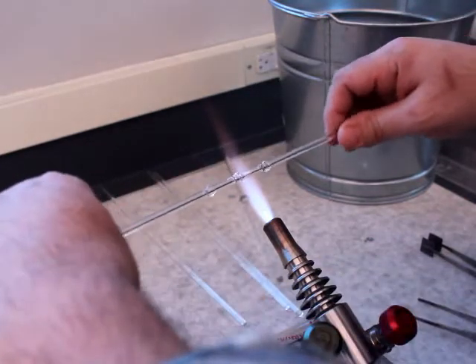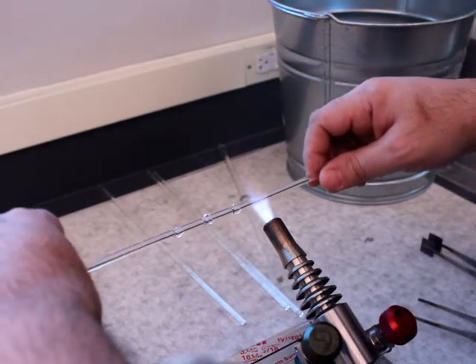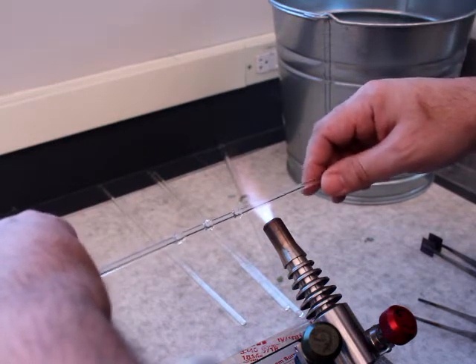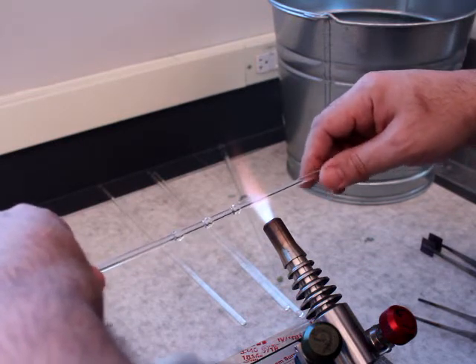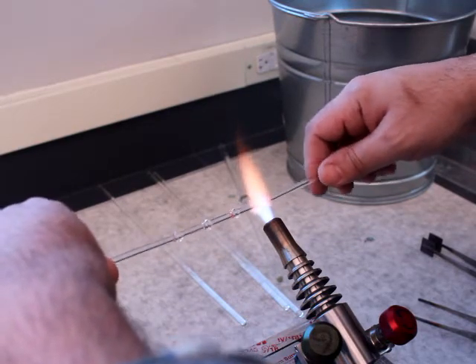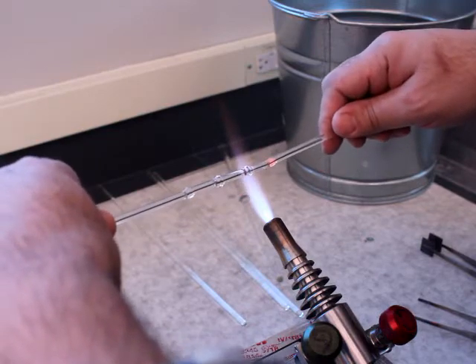Just to show how it can go terribly, terribly wrong: I'm going to heat up a gather of glass, get this good and hot, and then I'm going to stop rotating and just try and push.